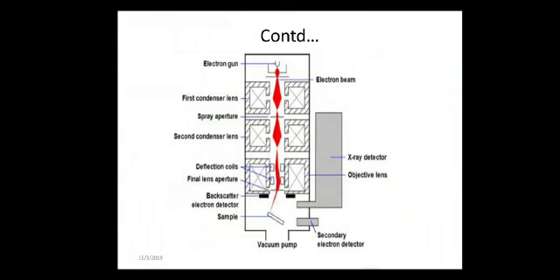The scanning electron microscope uses scanning coils, which create a magnetic field using fluctuating voltage to manipulate the electron beam. The scanning coils are able to move the beam precisely back and forth over a defined section of an object.